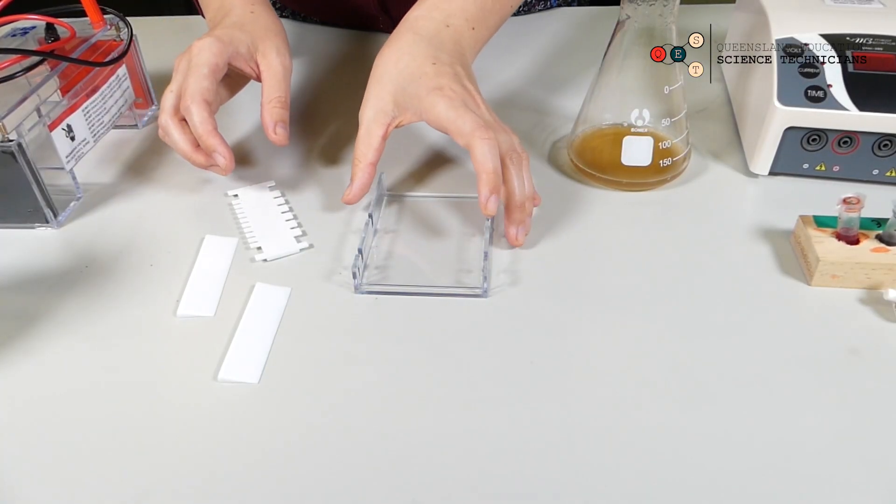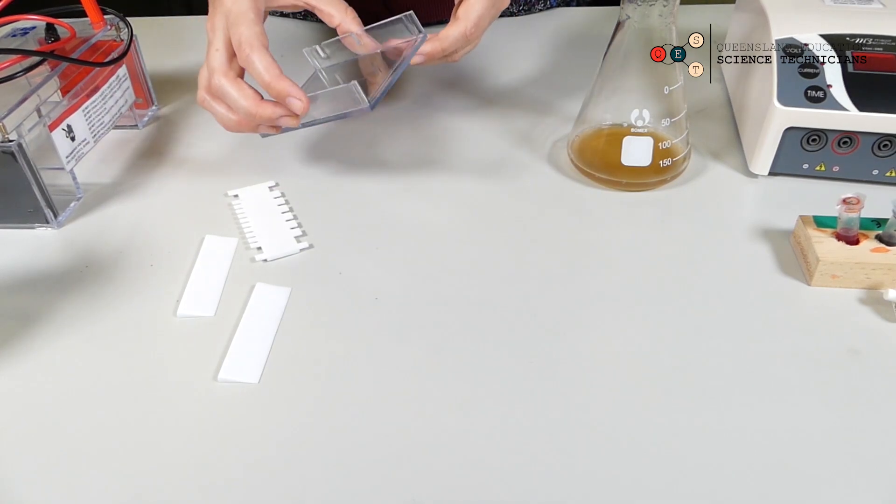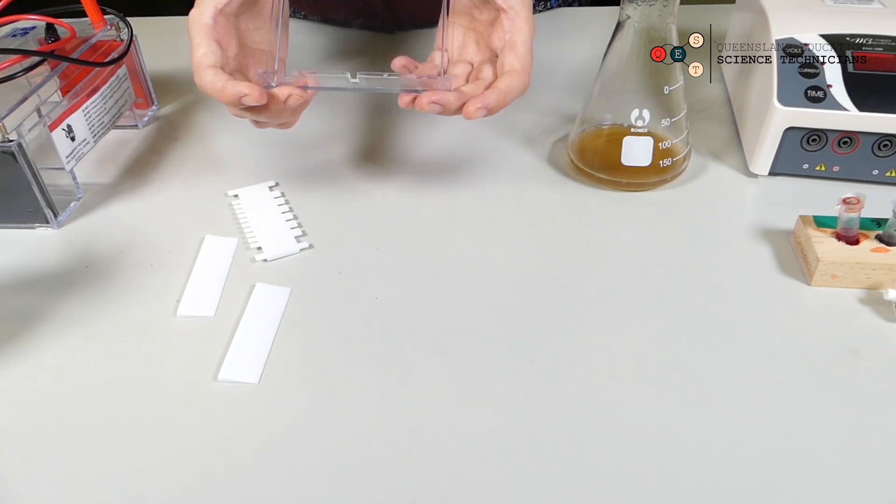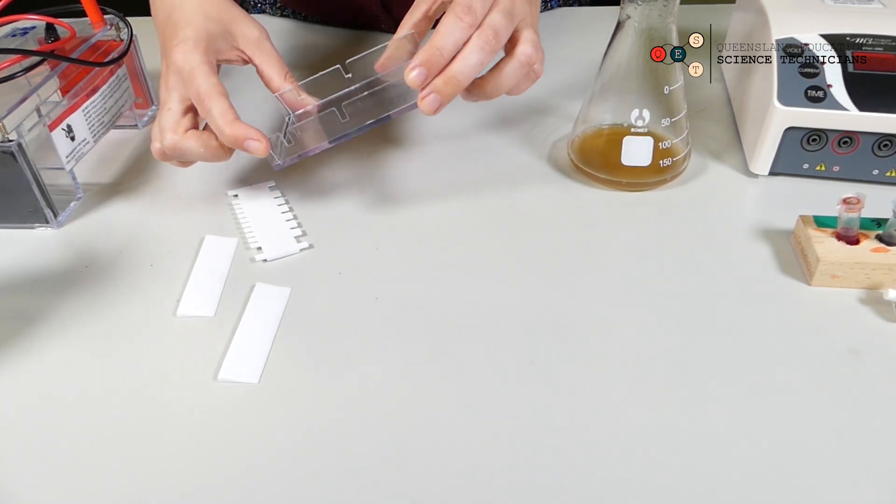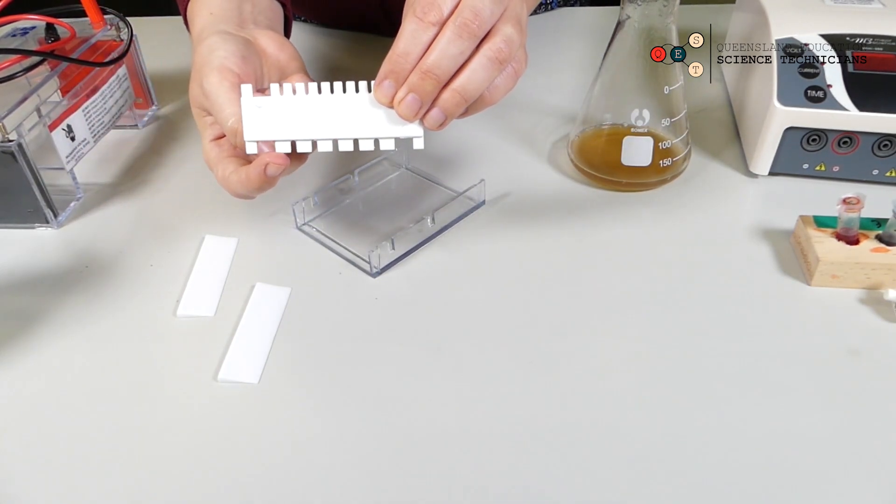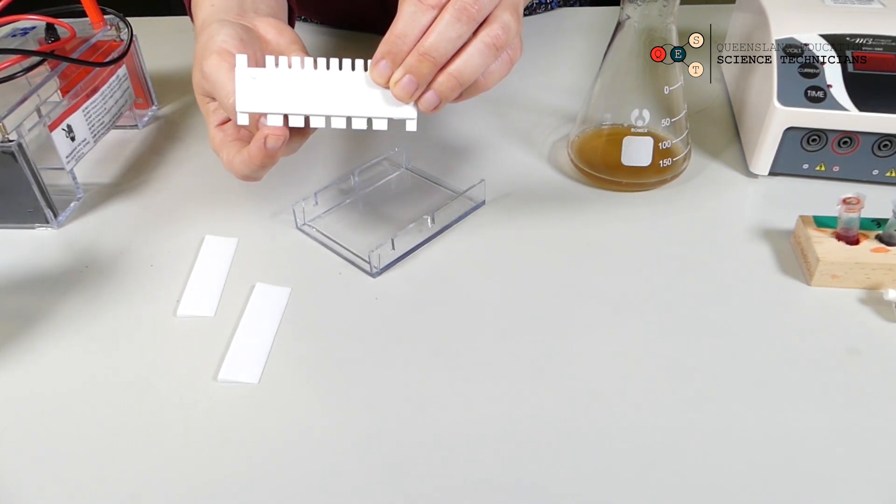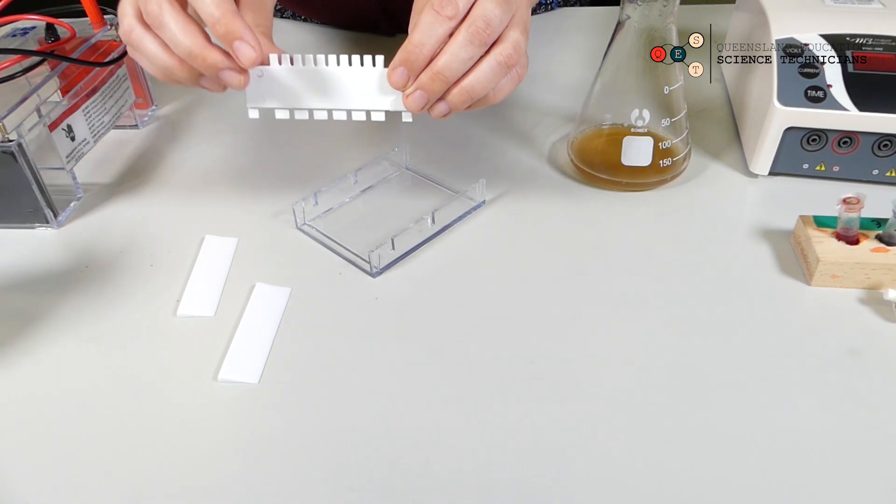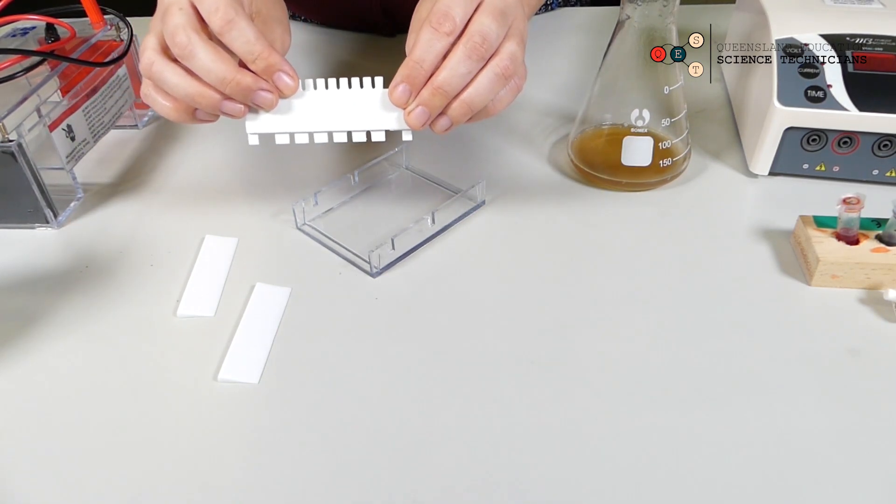So the first thing to do when setting up for some gel electrophoresis is we need to make our gels. We get this form and this comb. You can see the comb has teeth, and these teeth are what we use to make the indents in the gel that we pipette the food dye into.